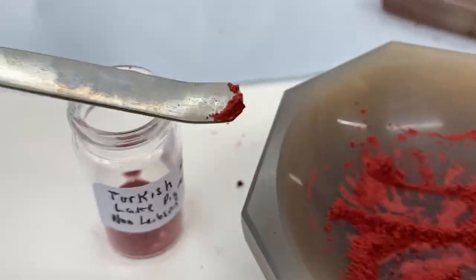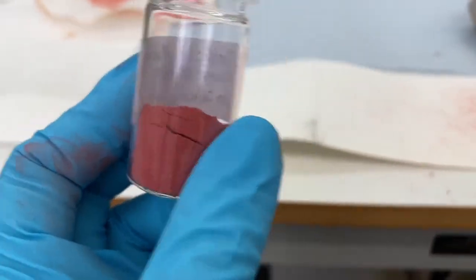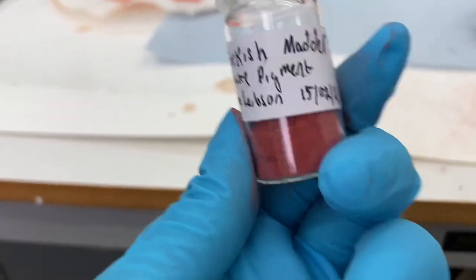The finely ground pigment is added into a vial for future use. For it to be used as the pigment you'd simply need to add it to a binder like oil or egg.